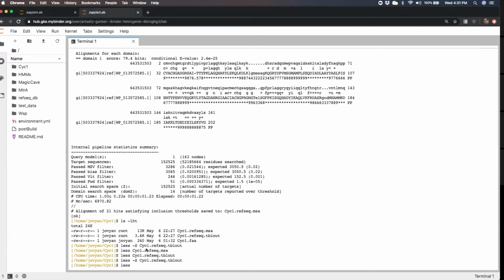It uses the principle of comparing a sequence to your target, and then to the larger database. What you then have is the score against your target versus the score against RefSeq. And basically the question becomes, is your sequence as similar to your sequence of interest as it is to any other sequence in the database? That's a way of getting rid of false positives or things that are perhaps multi-domain proteins that do different things.